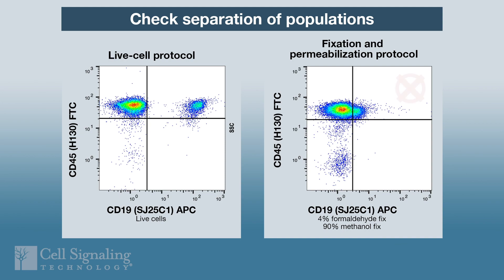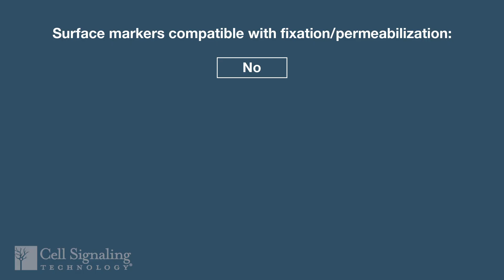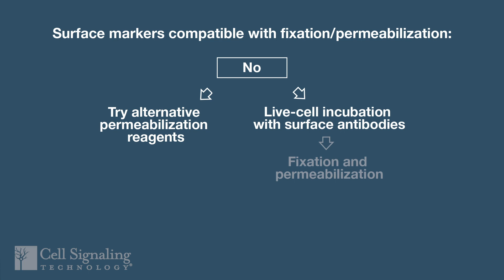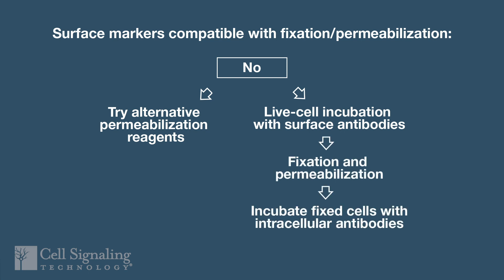If your surface marker antibody doesn't work, here are two things to try. First, consider alternative reagents for permeabilization. For example, if methanol isn't compatible with your surface markers, try switching to a detergent. Check with the manufacturer or test for compatibility with both your intracellular and extracellular targets. Second, if the surface marker antibodies are not compatible with fixed cells, split up your antibody incubation into two discrete parts. Incubate your surface marker antibodies with live cells first, then fix and permeabilize the cells, and finally incubate with intracellular antibodies. This approach often results in the best staining, but it can be tricky to manage the timing if your experiment also includes a stimulus or perturbation.